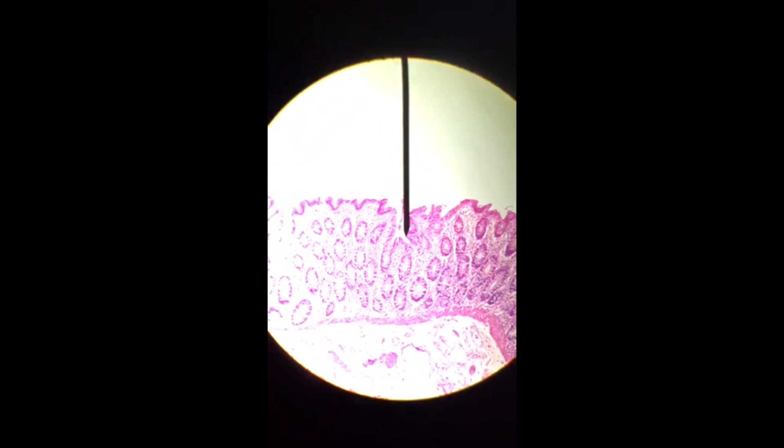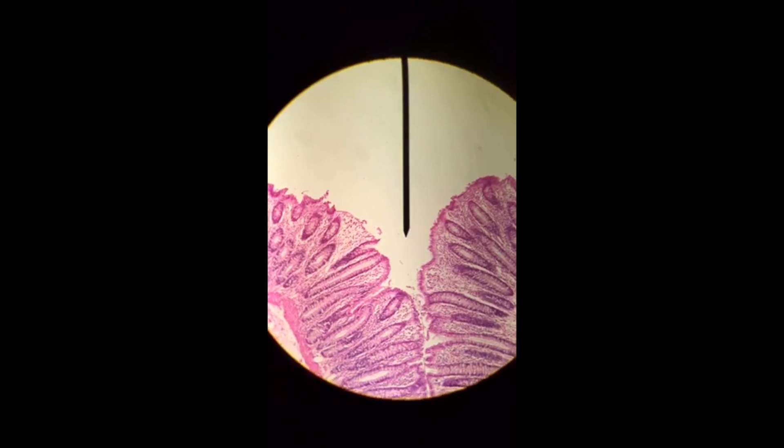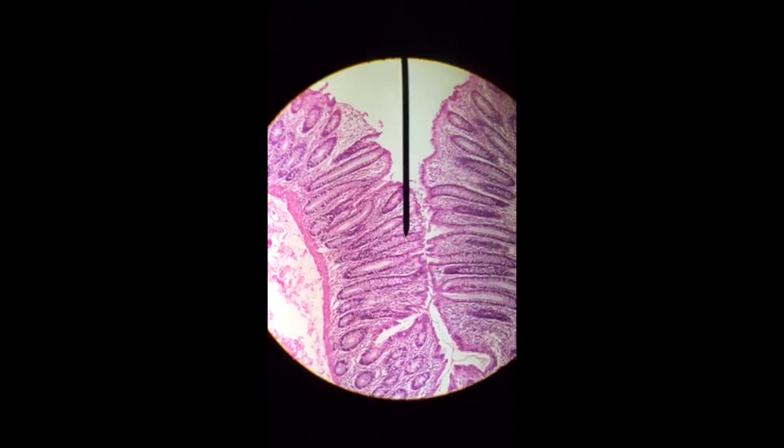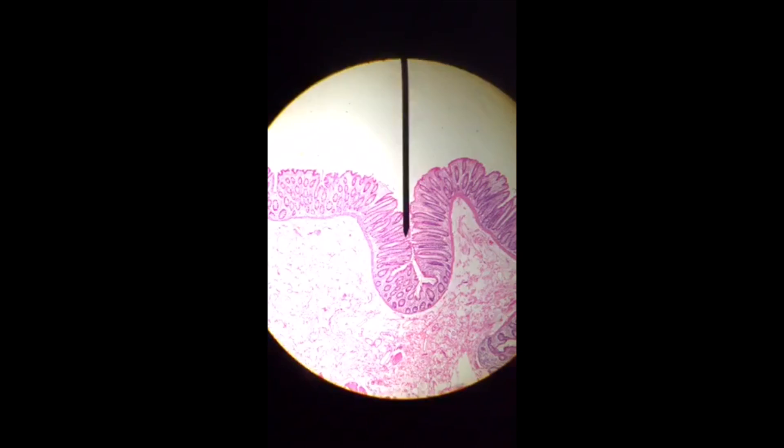Notice that these are glands that are going to assist in absorbing water and electrolytes. As well, our goblet cells are going to be secreting mucus to help facilitate movement of your feces through this large tube.